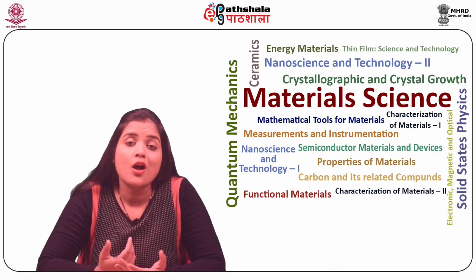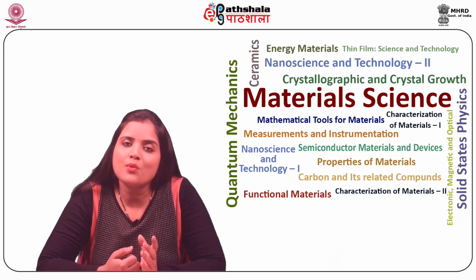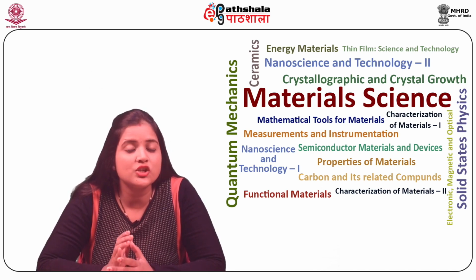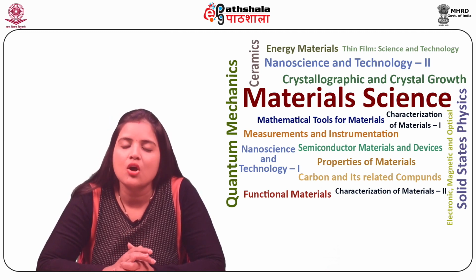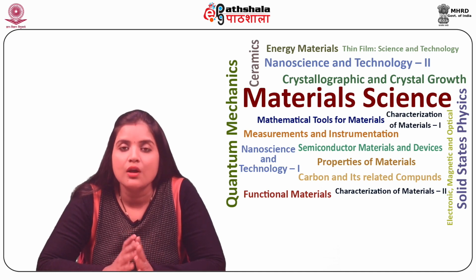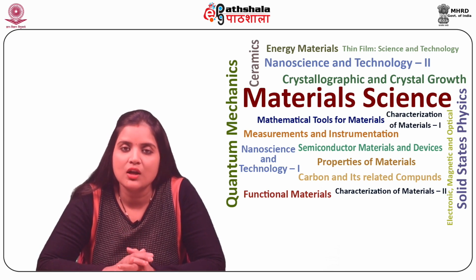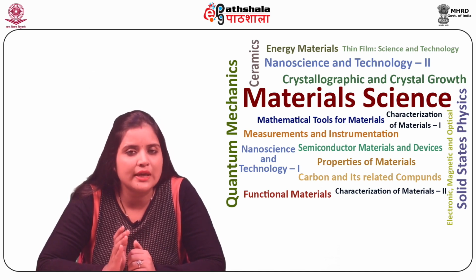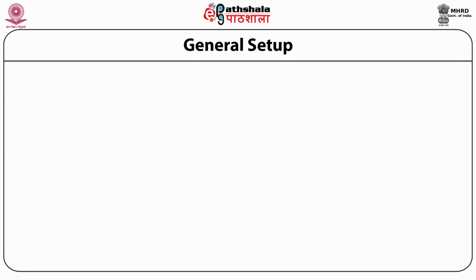Let us now discuss the applications of scanning near-field optical microscopy. The most important application of scanning near-field optical microscopy is in the study of single molecules. Here, usually the fluorescence of a single molecule is detected. The dynamics of the molecules, the local environment of the molecules, the polarization dependence of emission, and thereby the orientation of the dipole moment of the molecule, photobleaching, etc. have been investigated.